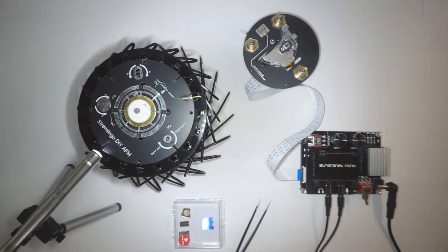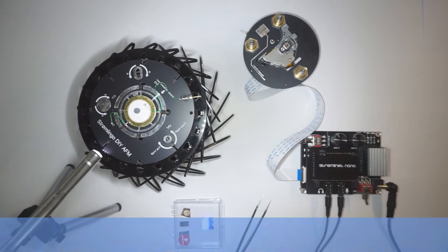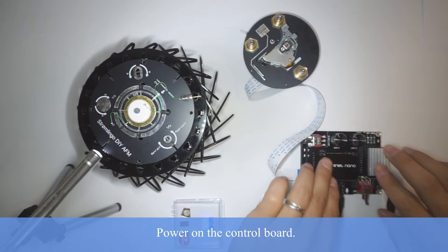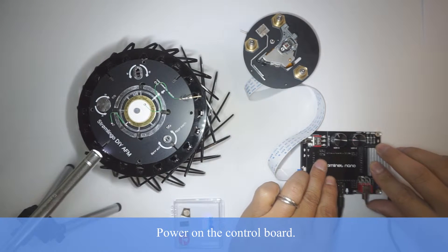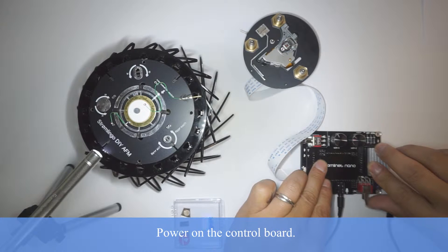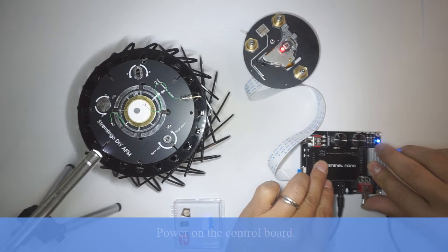First, let's power on the control board. This will turn on the laser.